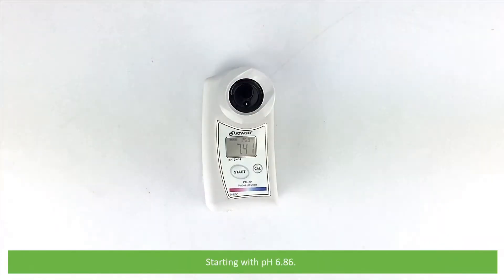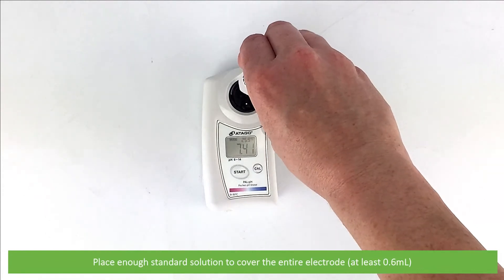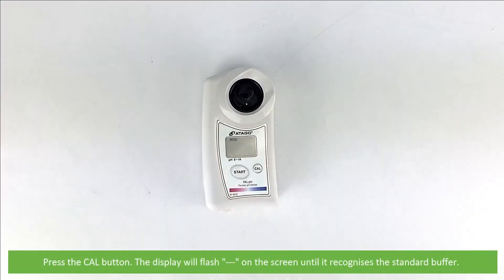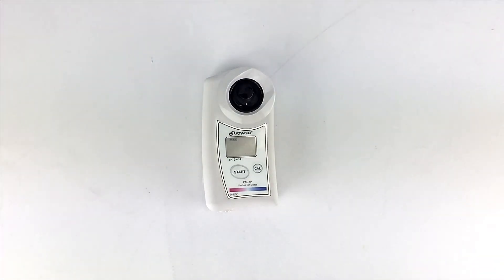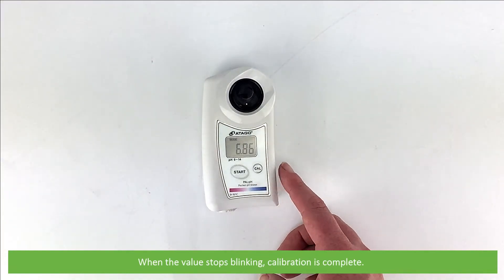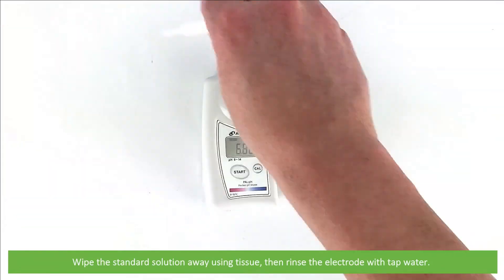Starting with pH 6.86, place enough standard solution to cover the entire electrode — that's at least 0.6 mils. Then press the CAL button. The display will flash 3 dashes on the screen until it recognises the standard buffer, then the buffer solution will blink on the screen around 10 times. When the value stops blinking, calibration is complete. Wipe the standard solution away using a tissue then rinse with tap water.